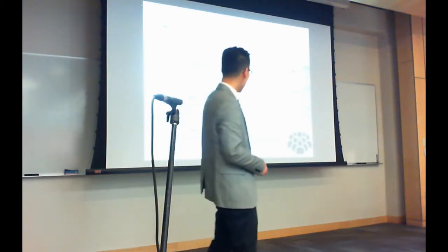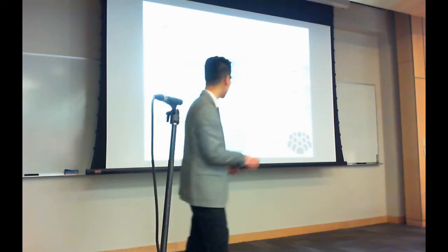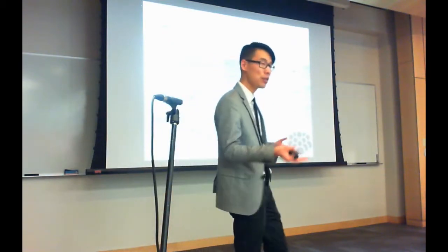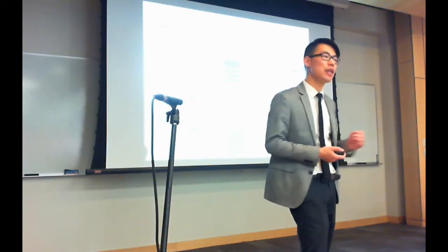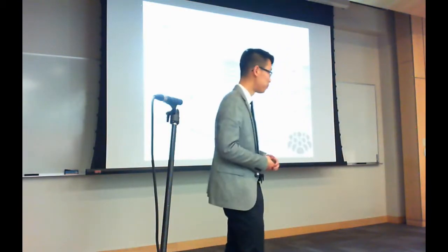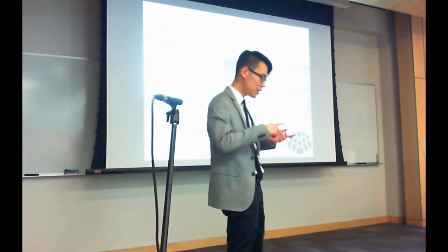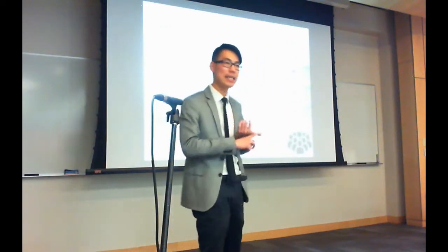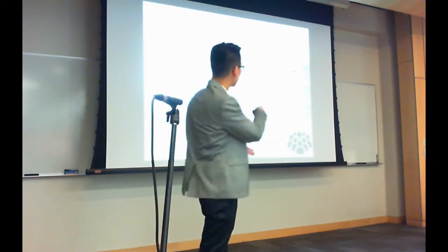And so just to give you a recap of all the things that we think people can do with these libraries. We have this MassIVE-KB library here. Researchers can download the library and do whatever they will with it to search on their own machines. They can even use it at the Center for Computational Mass Spectrometry and analyze their data through our web portal. And also, because MassIVE-KB has provenance, it tells us what search it came from, what tool, what parameters, what data set, and what specific spectra gave rise to it. It allows users to trace all this information back.